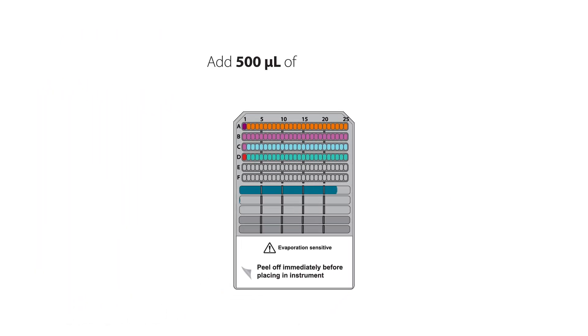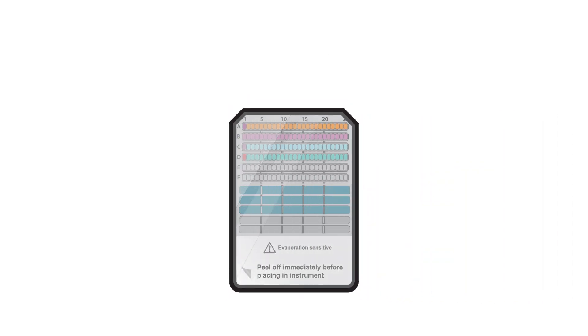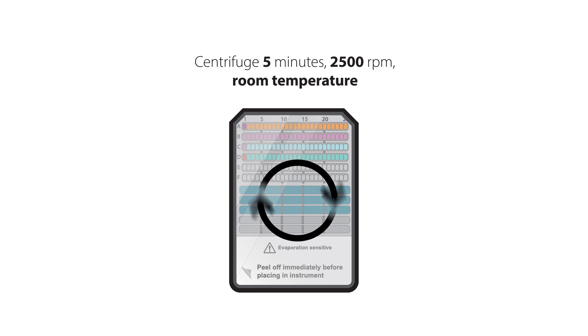Add 500 microliters of wash buffer to each wash buffer compartment. Place the cover on the plate and centrifuge the plate for 5 minutes at 2500 RPM at room temperature.